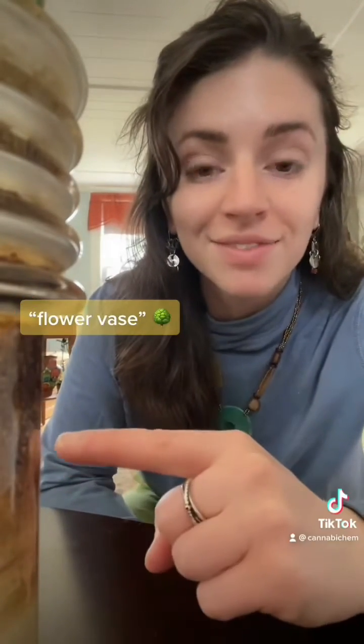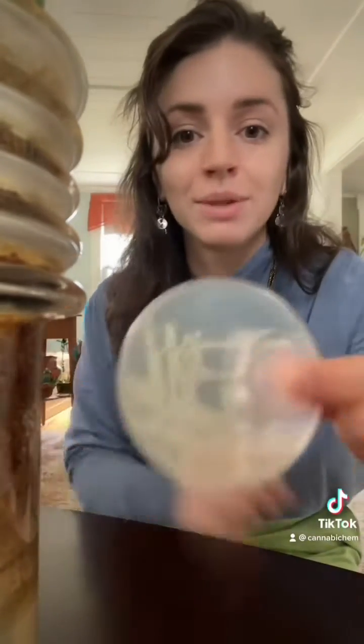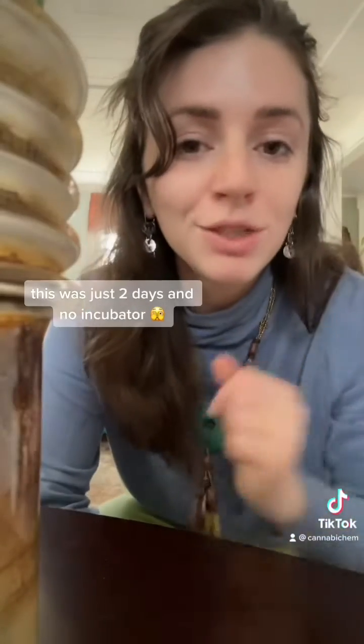We're back with an update after swabbing the water from this disgusting flower vase onto bacteria agar. I don't think anyone's going to be surprised with the results — we have a ton of bacteria growth on all the plates that we swabbed. I'm going to do a controlled experiment next where I clean this really well and then use it for periods of time and then swab it as I go. Stay tuned.